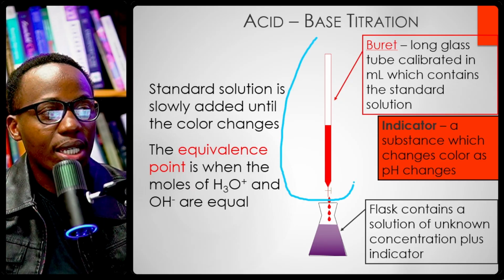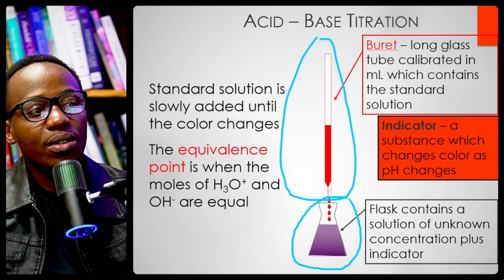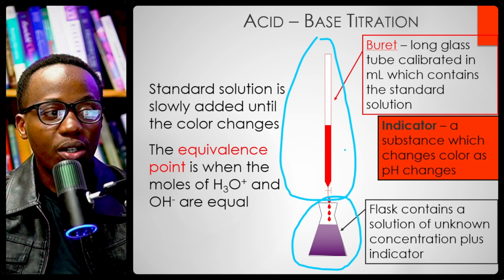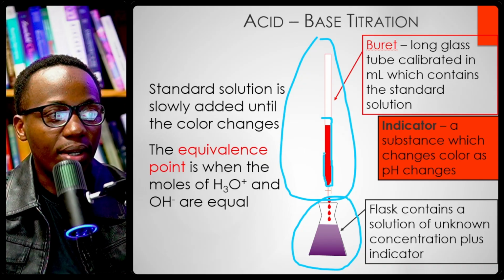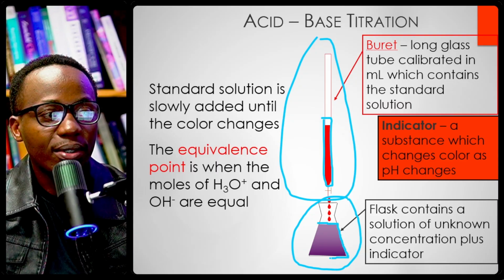So we have a burette here. Then we have a beaker. Not bigger. We're going to use a flask. A flask is much better, right? And then what we're going to do is add your known concentration at the top, and your unknown concentration at the bottom.